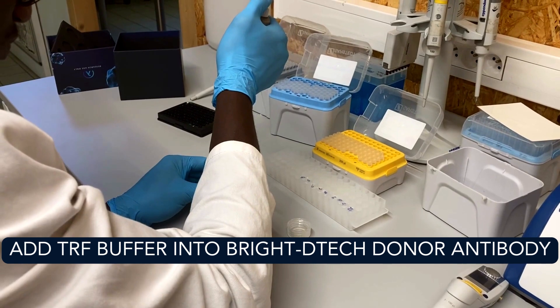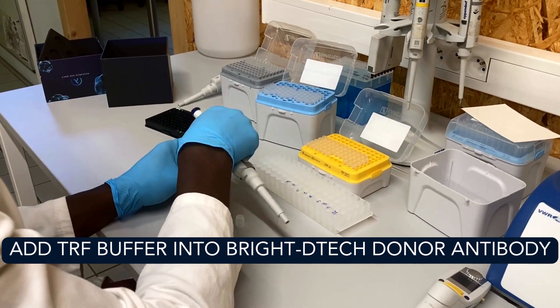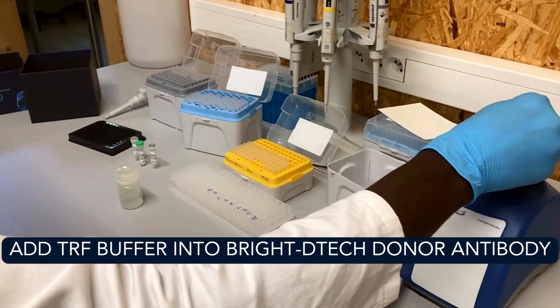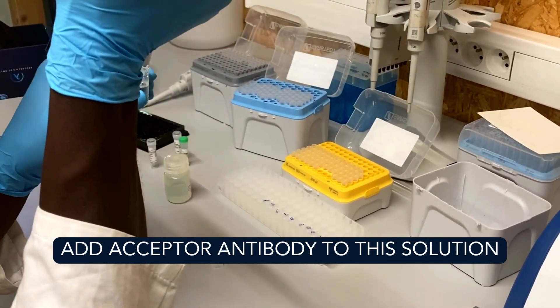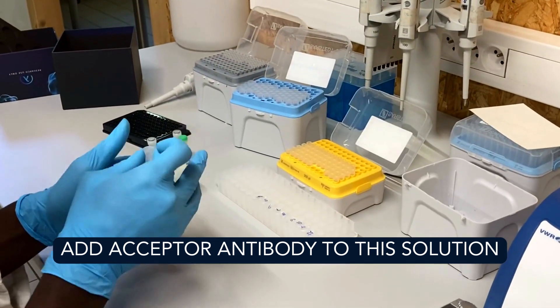For 24 points, add 2970 microliters of TRF buffer into the vial containing 24 microliters of Bright-Dtech donor antibody stock solution and vortex. Add 5 microliters of acceptor antibody to this solution and vortex. For fewer or more points, adjust the volume according to the protocol provided.